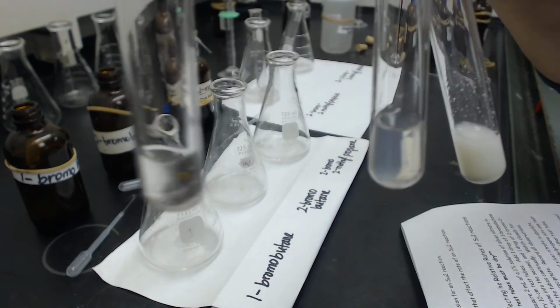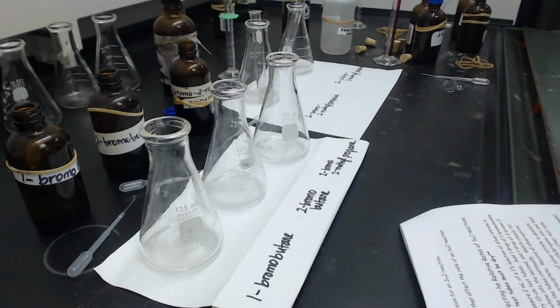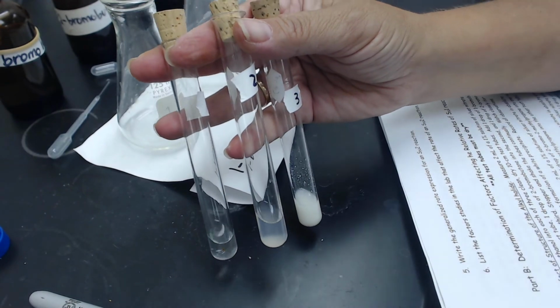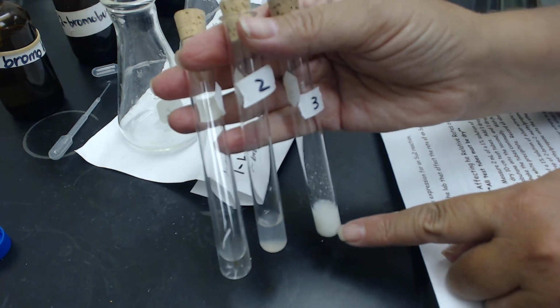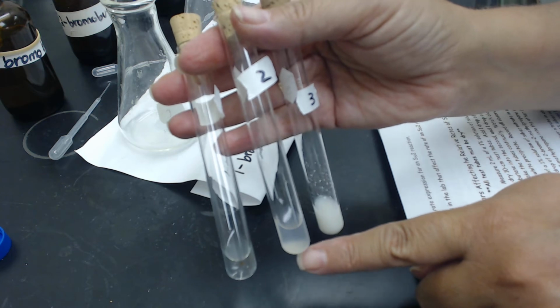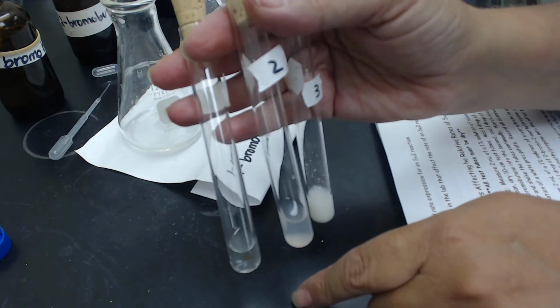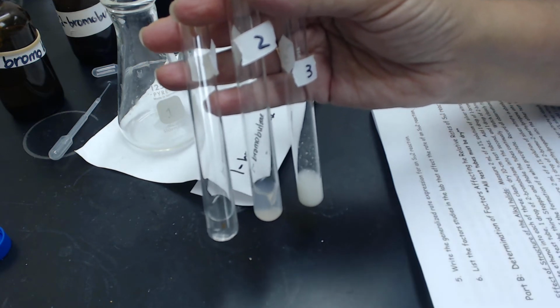It's getting a little bit cloudy, though it's hard to see with this. I don't know that the white works. If I put it in front of the black, you can see that number 3, which has the 2-bromo-2-methyl, precipitated right away. Number 2, which is the 2-bromobutane, which is secondary, has clouded up, but not nearly as fast. And then the 1-bromobutane has not clouded at all. All right, so I think that's good.